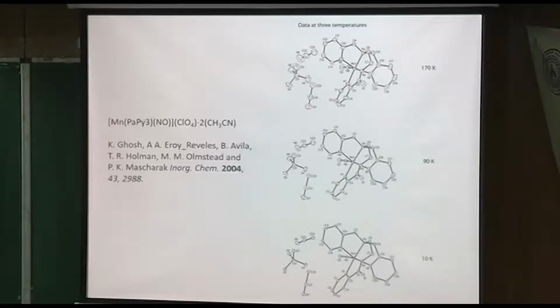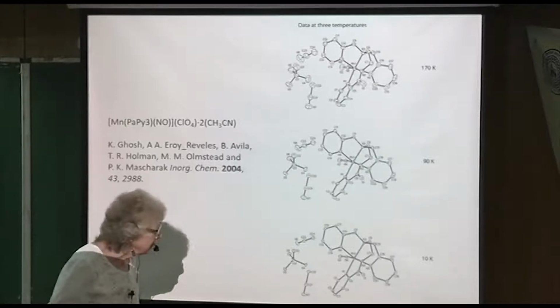So like a perchlorate really is tending to go like this as you raise the temperature. And you see that in the thermal ellipsoids because they're elongated and they look like they're rotating, just their shape, right? They're elongated and perpendicular to the bonds. Then there were a couple of acetonitriles in the structure. And then the middle atom here, which was manganese.